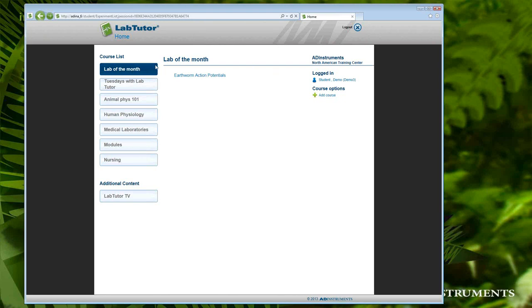For those of you that aren't maybe familiar with the Lab Tutor teaching suite, it is a server-based software platform that allows you to set up multiple courses. These are all the different courses that we have set up here on our training server. And then I've added the specific exercises that I want students to have available to them. So here's our earthworm action potential exercise.